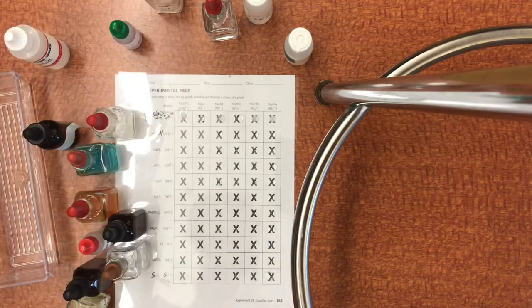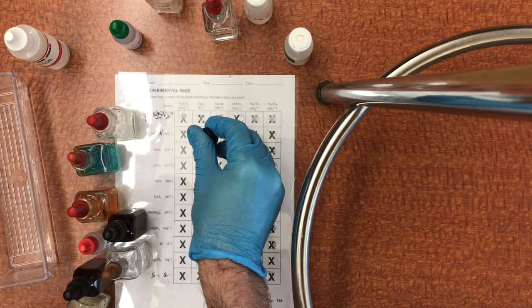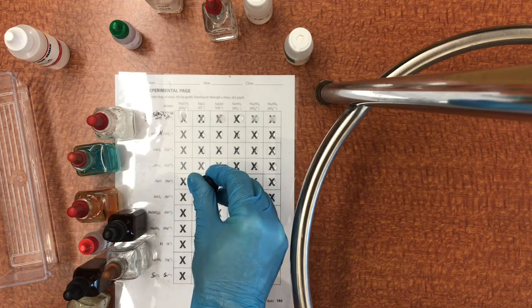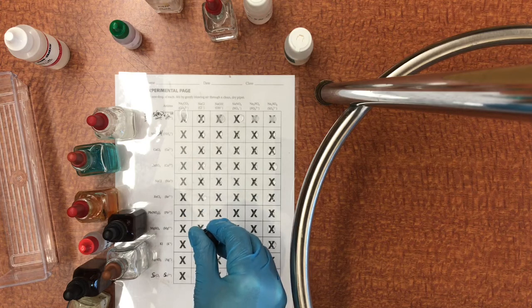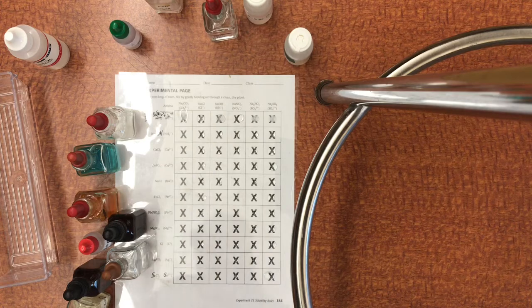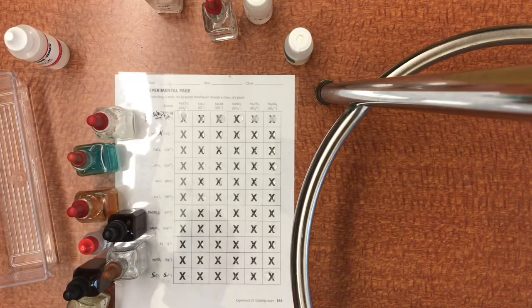Okay, so we're almost there. We're going to just put the sodium chloride down. And let's see. It'll be fun to see. There's a couple of these reactions which are actually going to be more interesting. I did have to do a couple of substitutions, so we'll see those. The next one, I believe, is the first substitution I had to make, and that is the substitution of ammonium chloride for ammonium hydroxide, and that's simply because I didn't have any ammonium chloride right now.